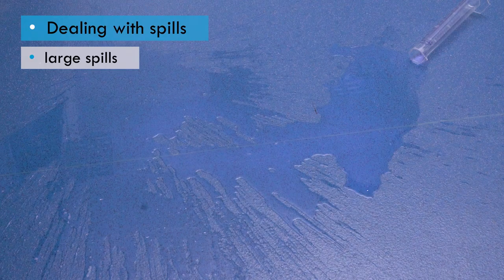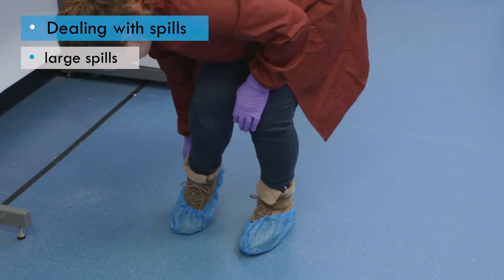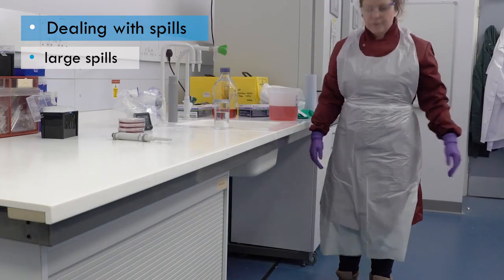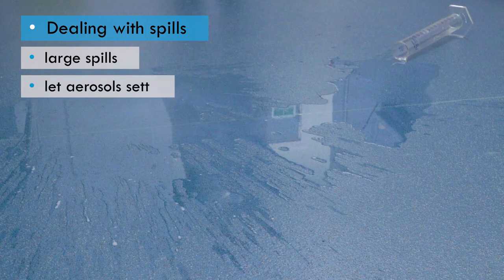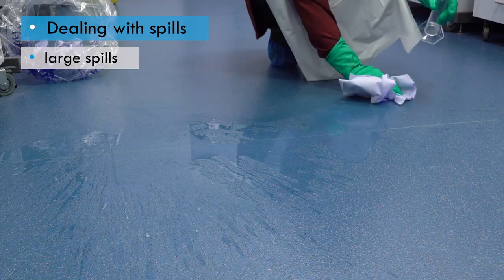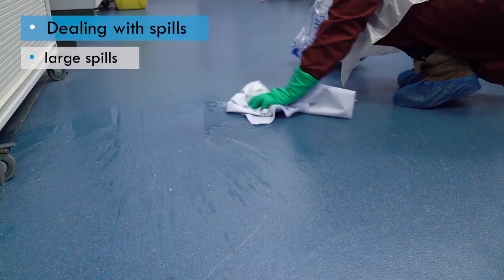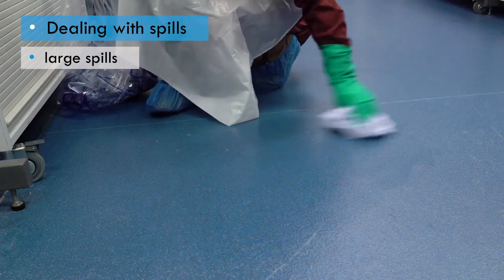When clearing up large spills, there's a greater risk of splashing, so you may need additional splash protection, such as disposable plastic shoe covers or rubber boots, a plastic apron to protect the lab coat, and gloves that will protect against the disinfectant. Where possible, leave the area and allow any potential aerosols to settle out before returning to mop up the spill. Work slowly to reduce any splashing and wipe from the outer edges towards the center of the spill so that you don't increase the area of contamination.